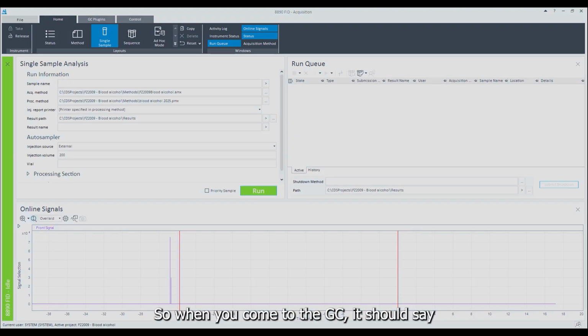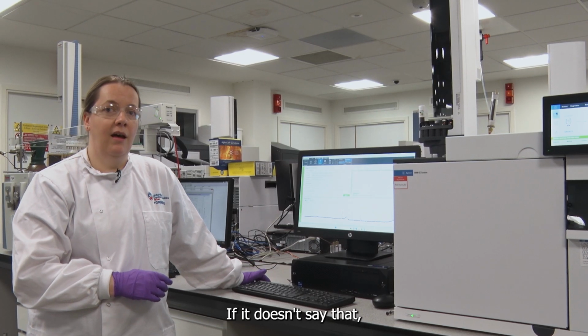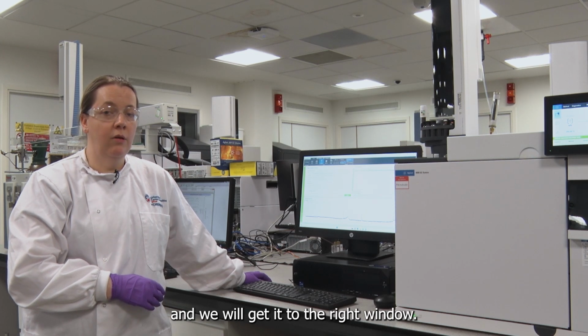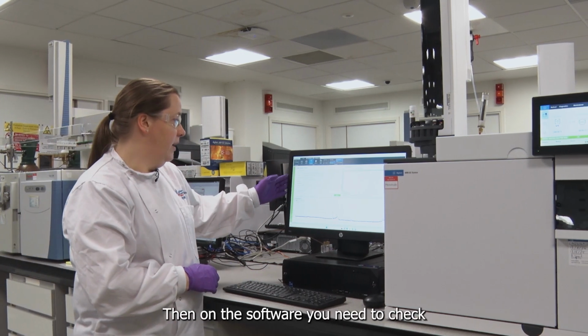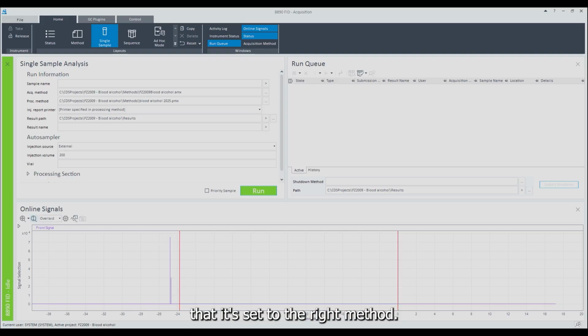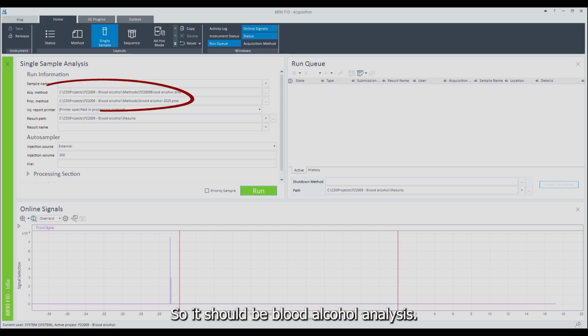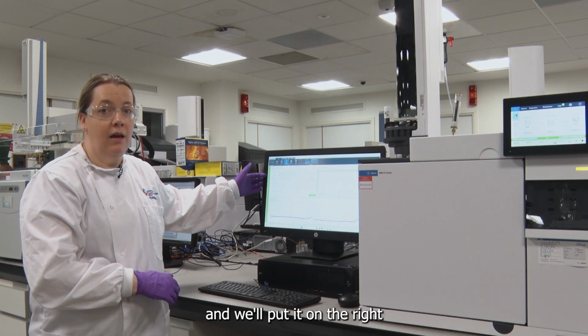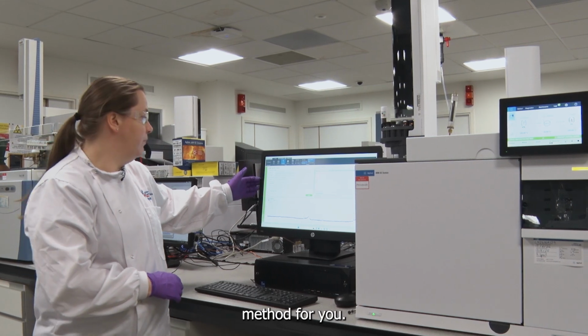So when you come to the GC, it should say single sample analysis. If it doesn't say that, ask me or one of the technicians and we will get it to the right window. Then on the software, you need to check that it's set to the right method. So it should be blood alcohol analysis and your module name. If it isn't, again ask and we'll put it on the right method for you.